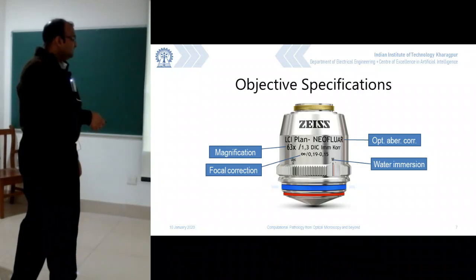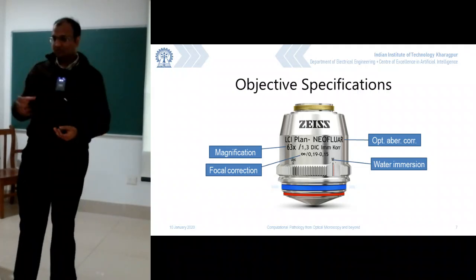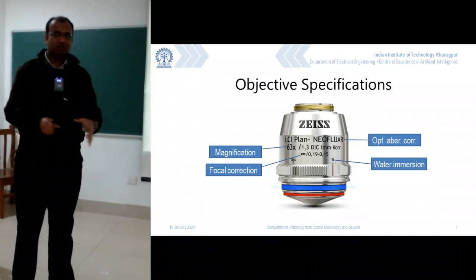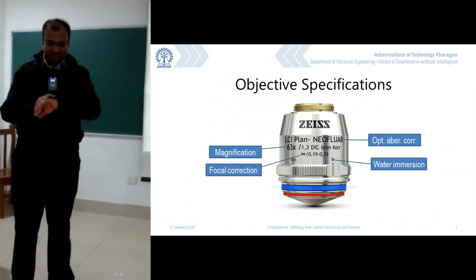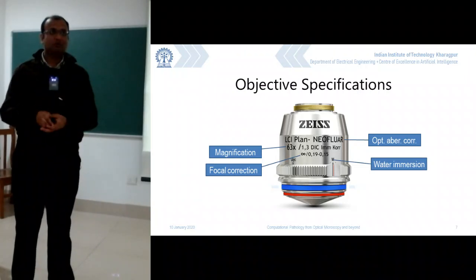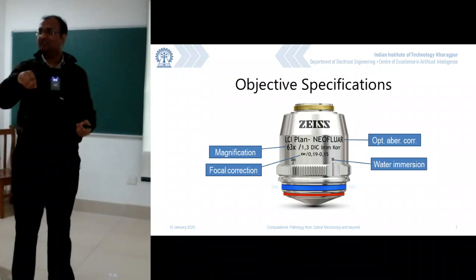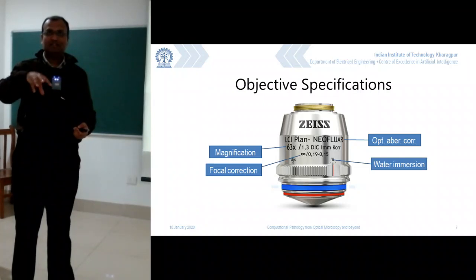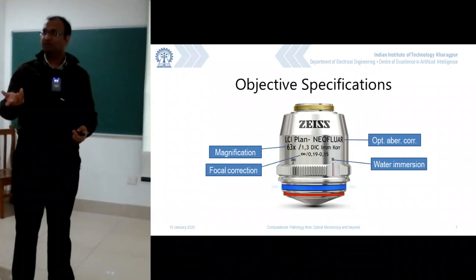And this is a critical part of it. So I said that whether a lens can be used only in water or if I am immersing it in oil. Now look at a problem. If I am immersing it in oil, I solved all the problems around refractive index, but then I also introduced more problems because that oil is going to seep inside the lens. The moment water or oil seeps inside the lens, there will be microbes, bacteria, fungus and everything which starts growing inside, and then your lens becomes corrupted because they are going to obstruct all the light which comes down over there.